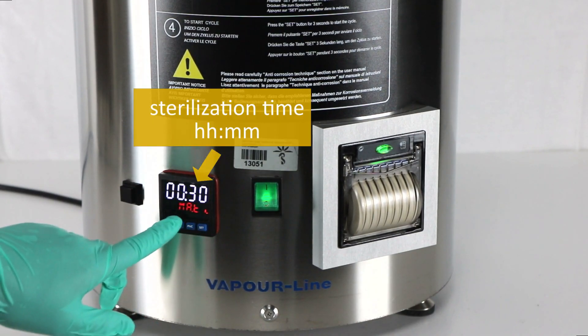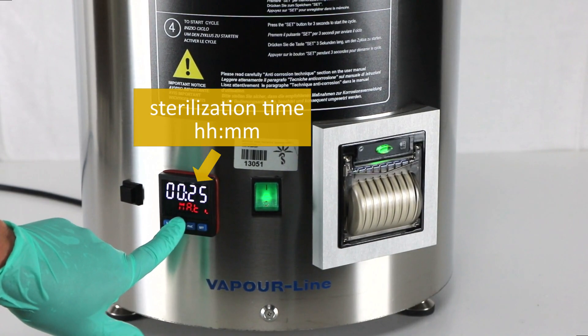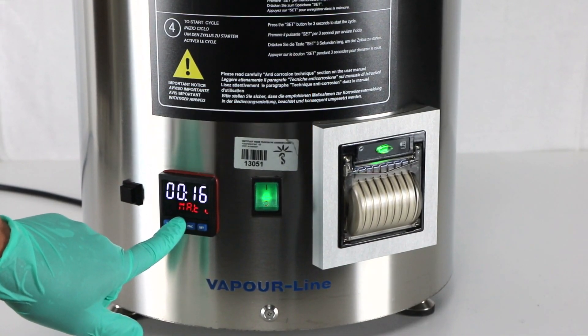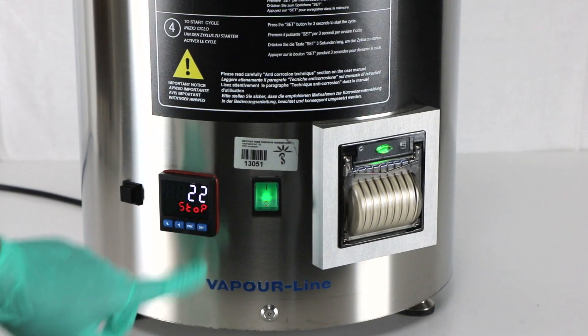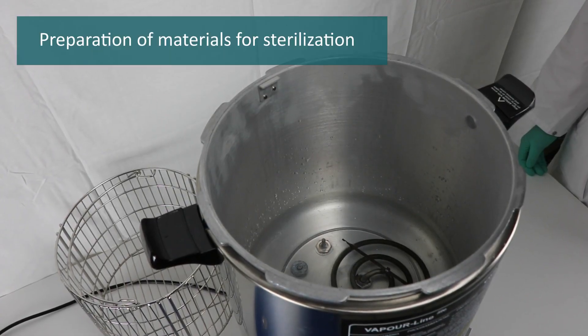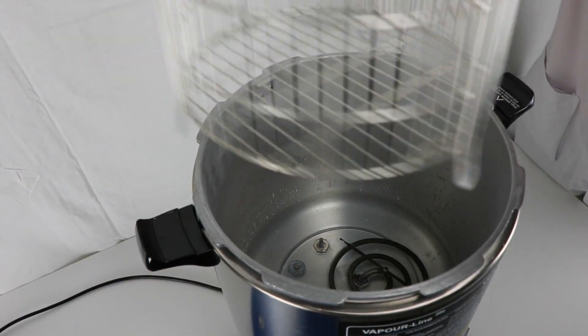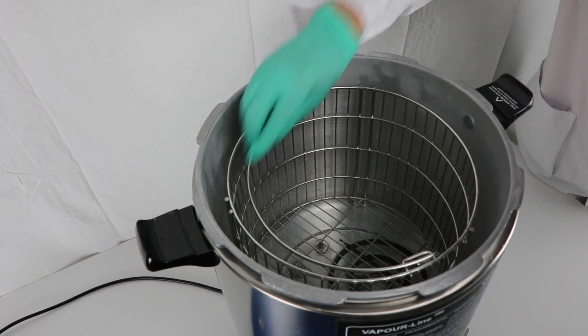Repeat the same process for Set.2 to set the sterilization time. Press Set on the command panel until MA.T appears on the lower display. Use the arrows to select the sterilization time in minutes. Press Set to save to memory; the parameter will be stored even after the device is turned off.